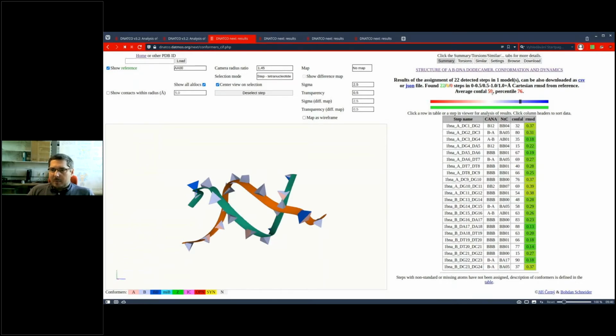Because we can calculate this value per structure, we can also compare it to the rest of the PDB, so it also gives you a percentile with respect to the rest of the PDB. And the ConfVal, the percentile and these groups are also graphically represented here. Here it's boring because you have only green, because this is actually quite a good structure.